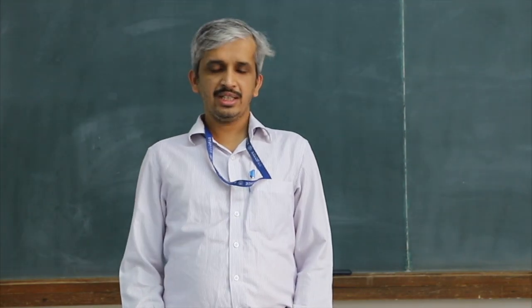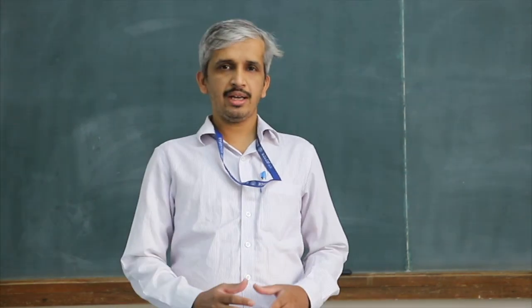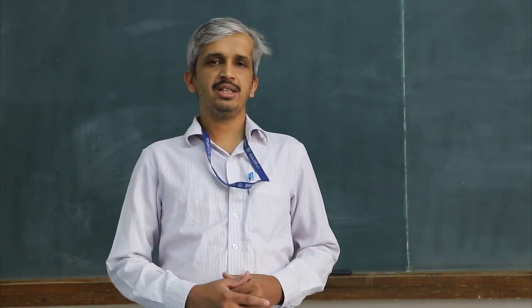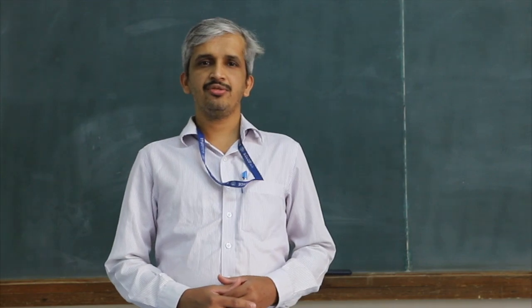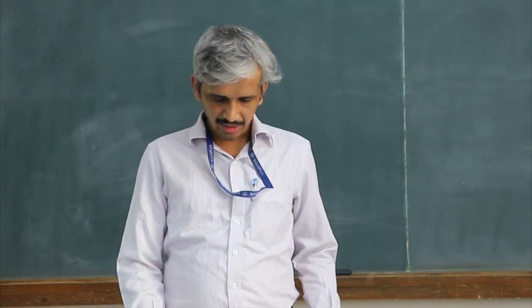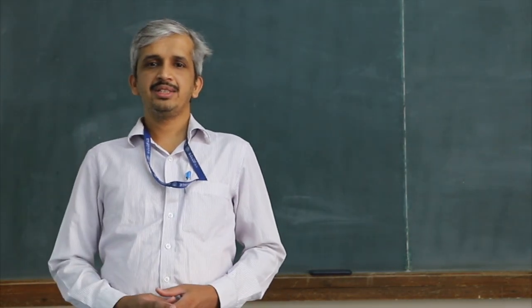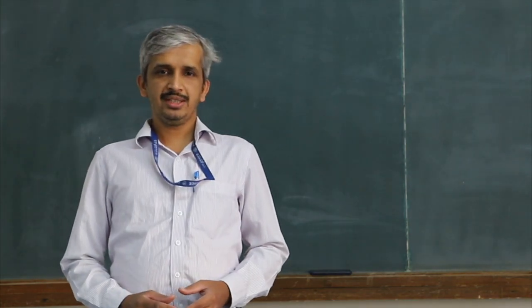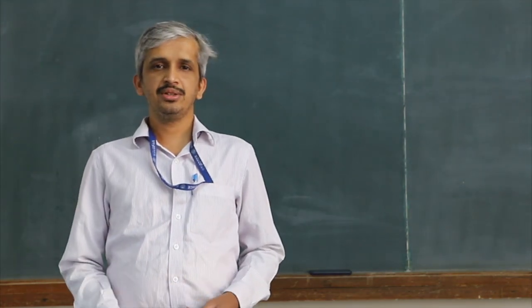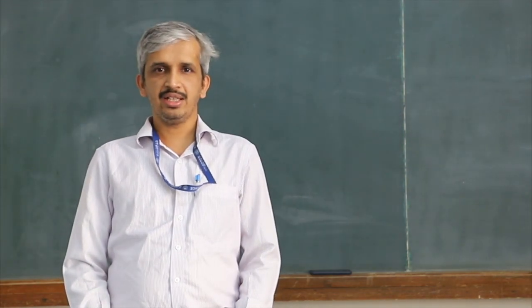So these are the 10 experiments we currently have for this semester, and for each experiment we will have a separate video wherein you can see the demonstration of the conduct of each experiment. In today's video we will just see the overview of the engineering chemistry lab and how to do standard solution preparation using a standard flask or volumetric flask. There are 2 common apparatus used for volumetric analysis, that is for titration.